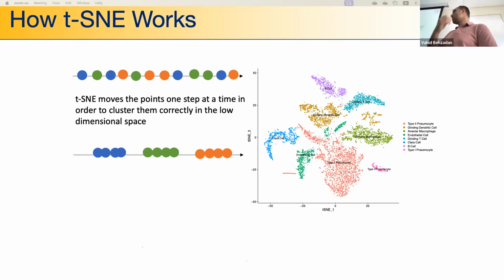Why? What does that tell? It tells you what happens for these specific cells between normal and the cancer, for example. Because as you said, they are not the same. There is variability, and this variability could be due to a disease or external factor or whatever. That's not causal. That's just discrimination, in the statistical sense.